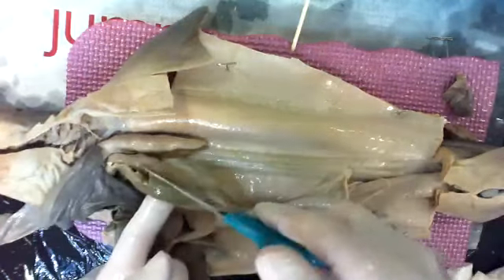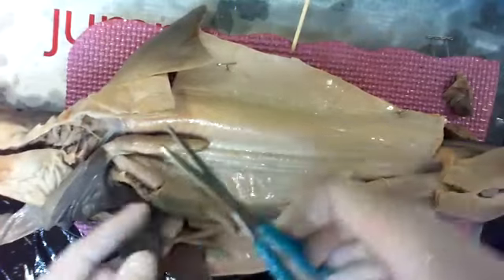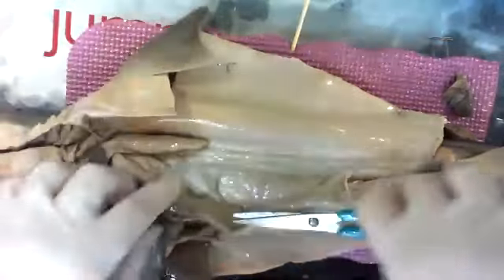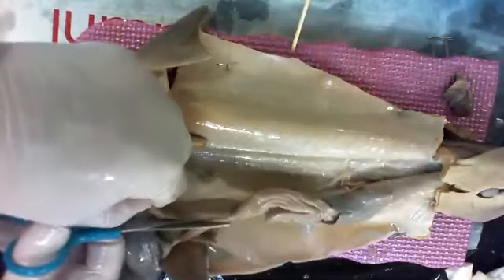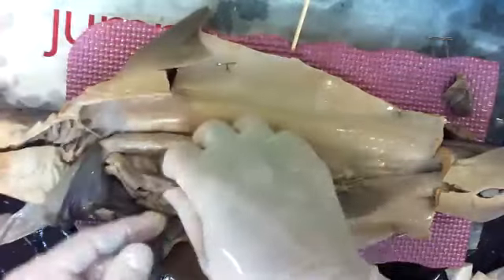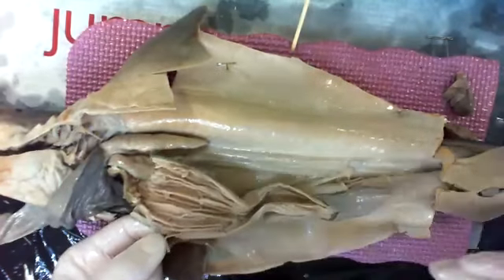Right? Next thing I did is I went inside that hole I just cut and I cut up. Don't cut the liver. I cut up about to the liver. And then I'll do the same thing going down. I'm gonna cut down. You can cut down as far as you want, but when you get down here, you're gonna see it turns around and comes back up like a J. So that's what I'll do. I'm just gonna cut down. Cut. And it's mostly muscular up here and dense. So when I open this up, I have more of that gooey stuff. Gross.